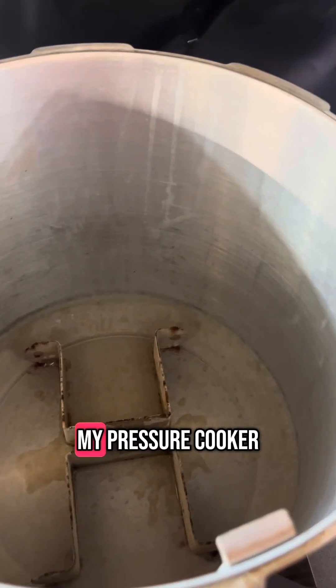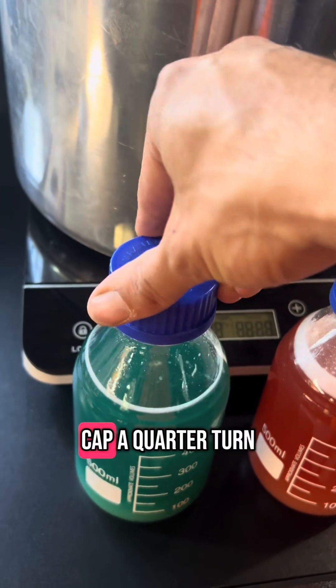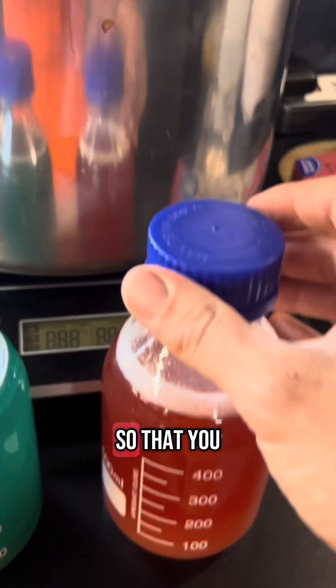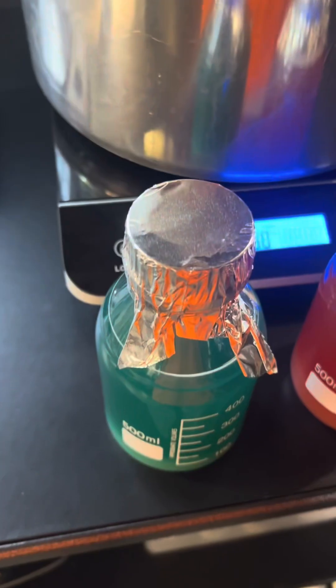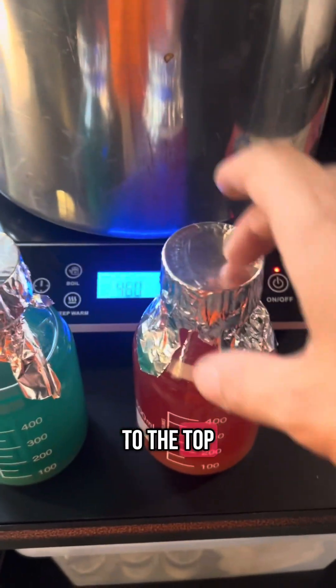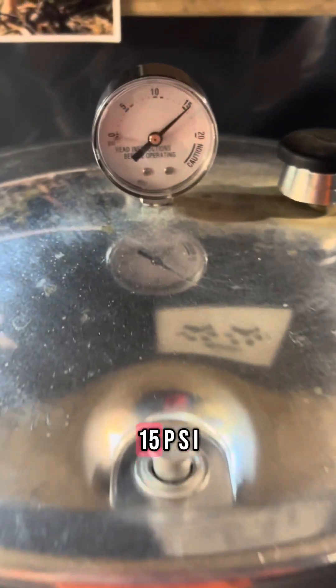Fill your pressure cooker with water, and remember to unscrew the cap a quarter turn so that excess pressure can escape from the jars. Add some foil to the top, then place them into your pressure cooker. You want to cook this for 30 minutes at 15 PSI.